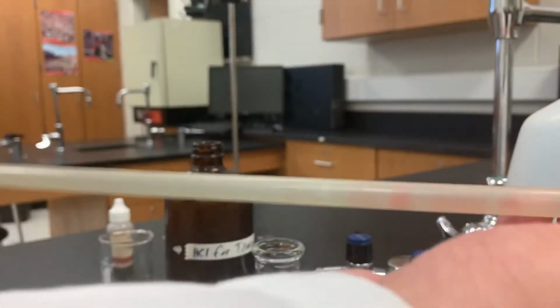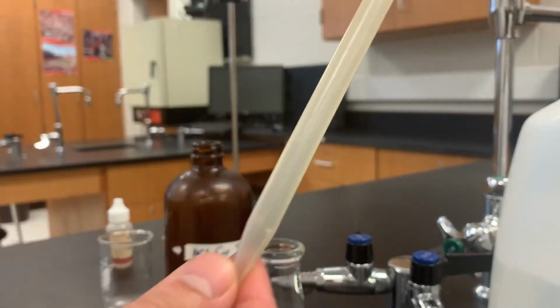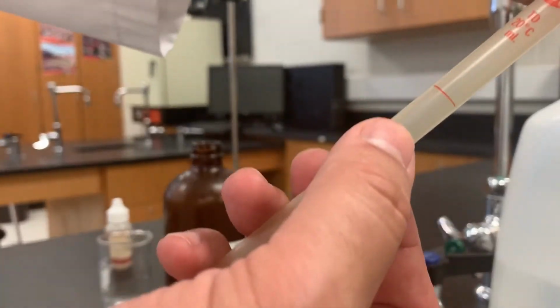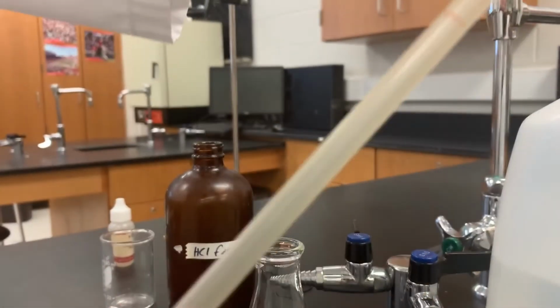And I'm going to use this device called a pipette, which looks like a straw with a tip on the end, and it's got this little line right here. And when you fill the liquid up to the line, that is exactly 10 milliliters.